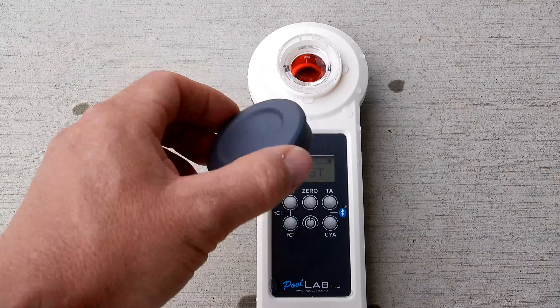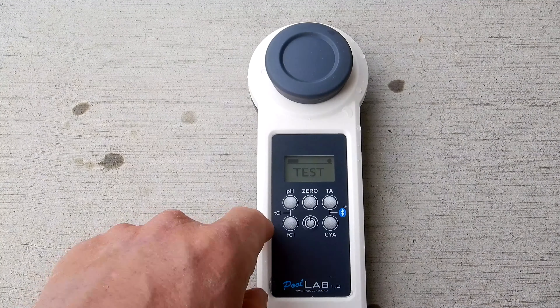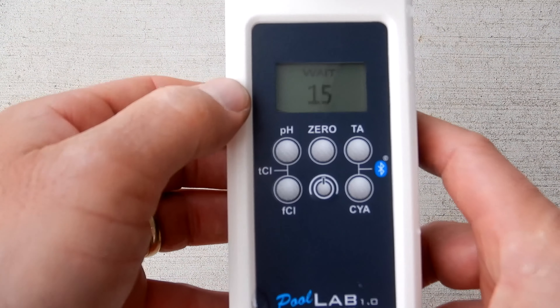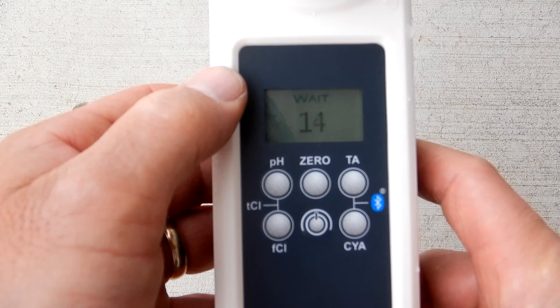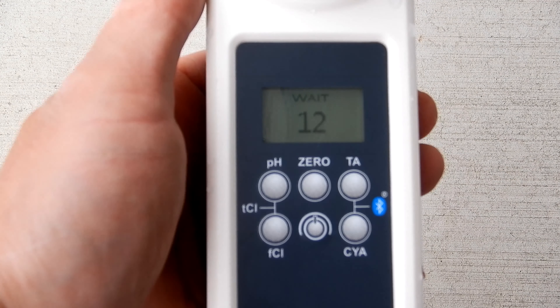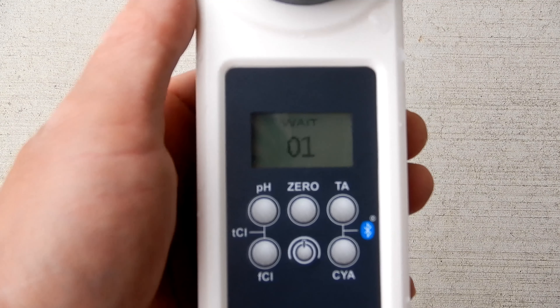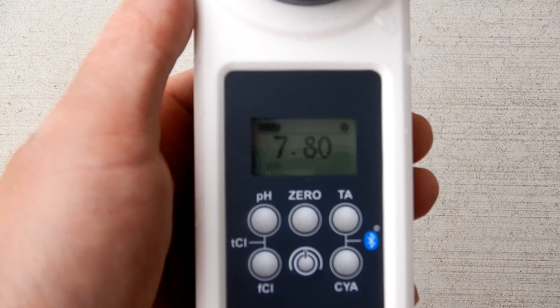Now cover the water sample with the cap. Since we're doing pH, I'm going to go ahead and hit the pH button right here. It'll count down, then it'll give me the pH reading in this pool. The pH reading here is 7.8.